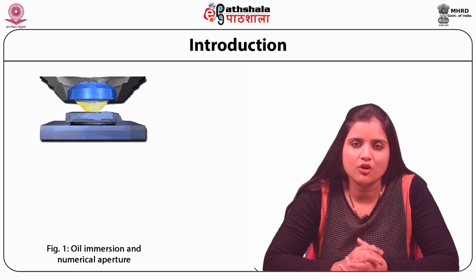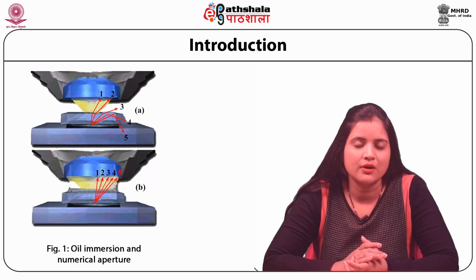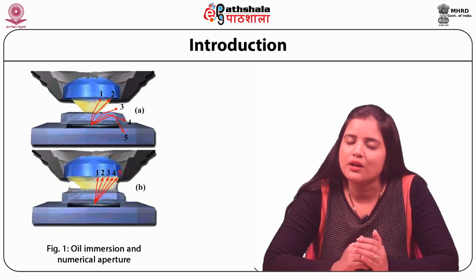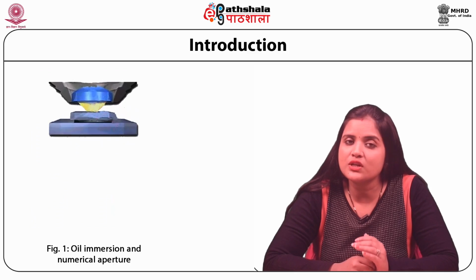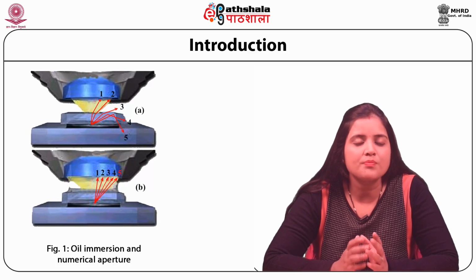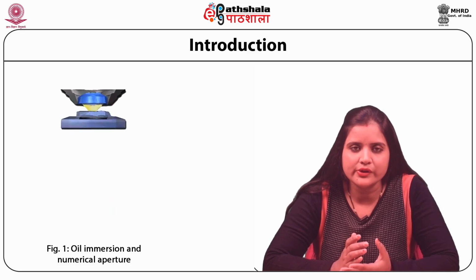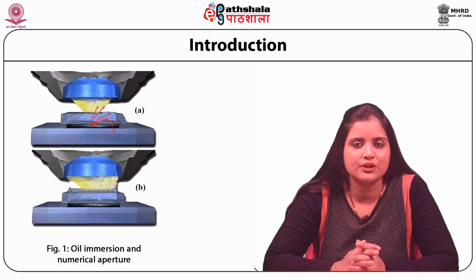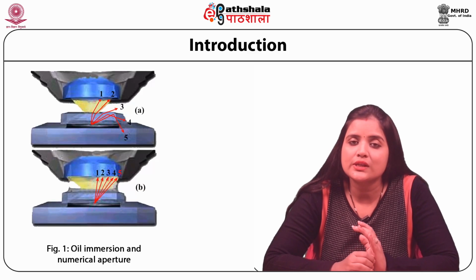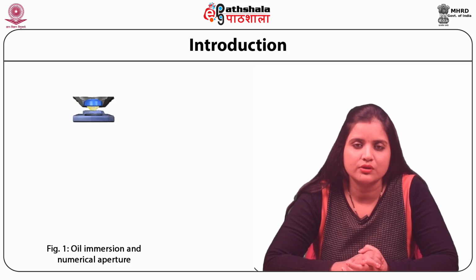The oil immersion objective is a specially designed objective lens which can be utilized in this way. After immersing in oil, many condensers give optimal resolution. All the diffraction orders need to be collected in order to successfully reconstruct the image of the object.